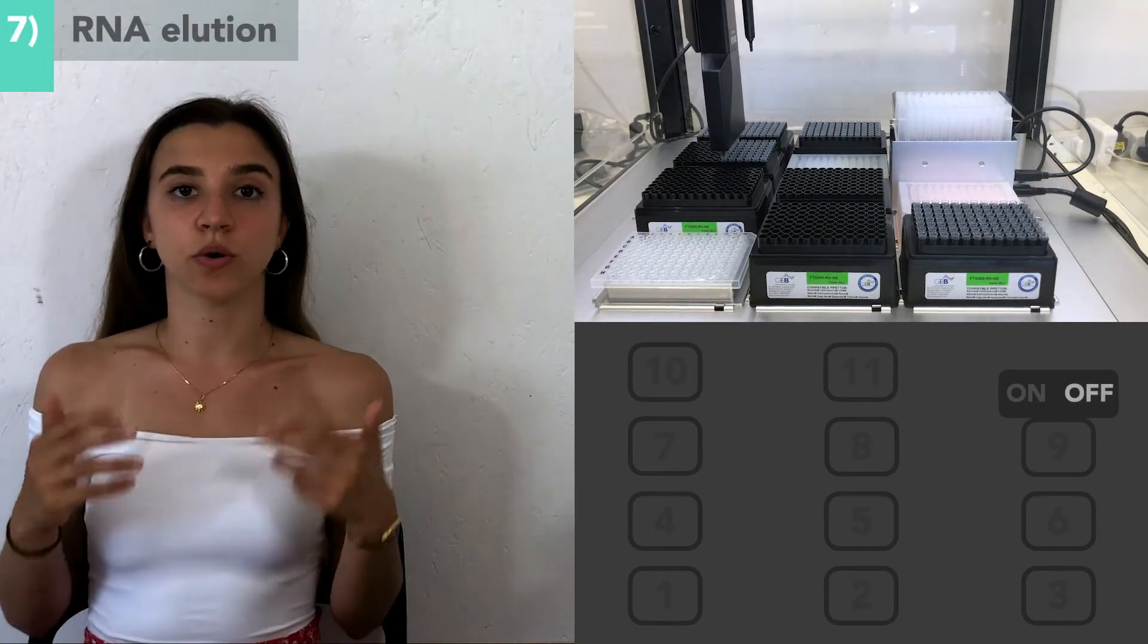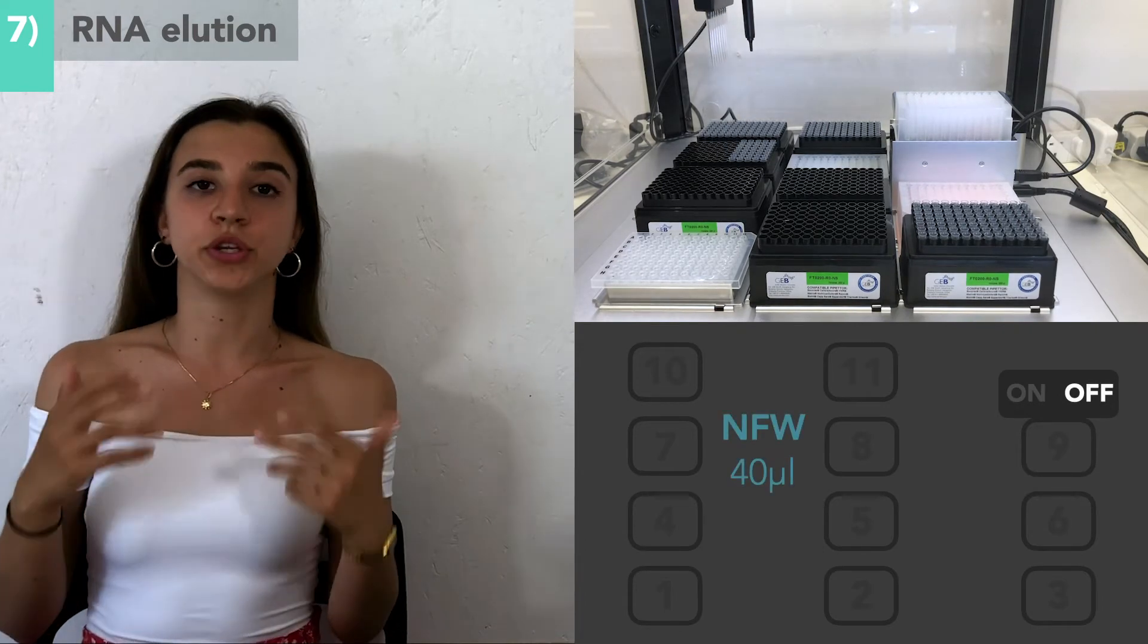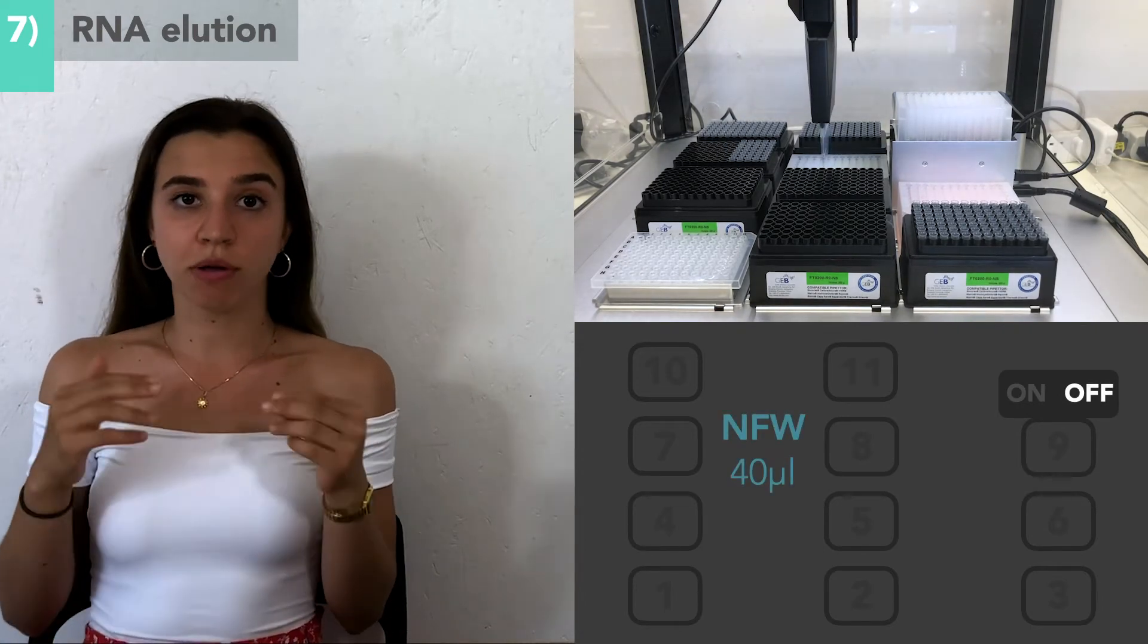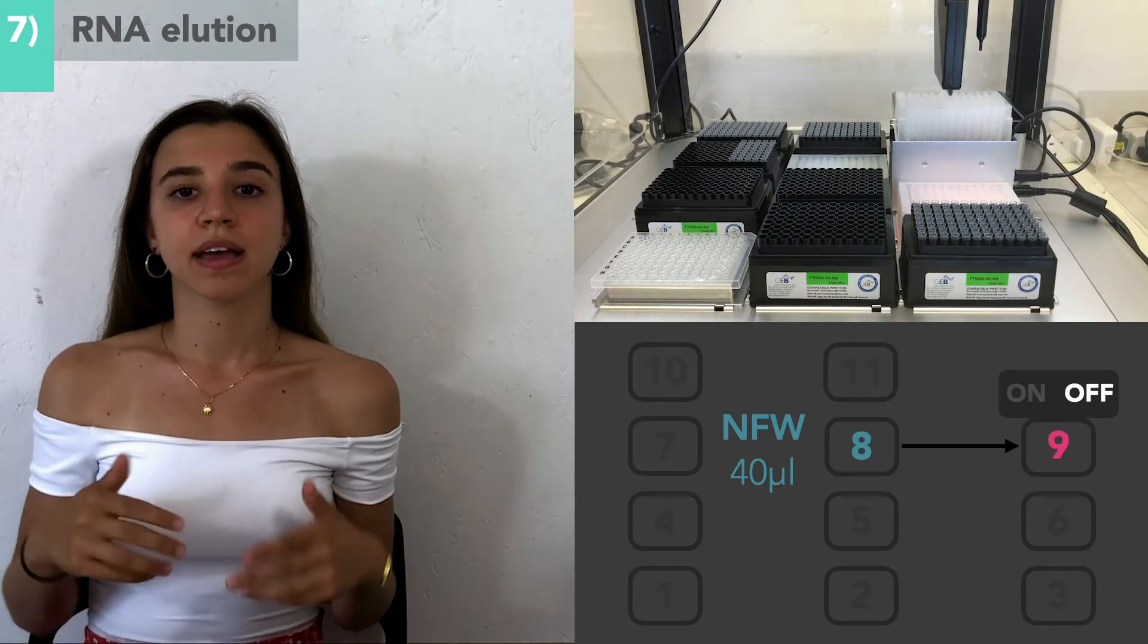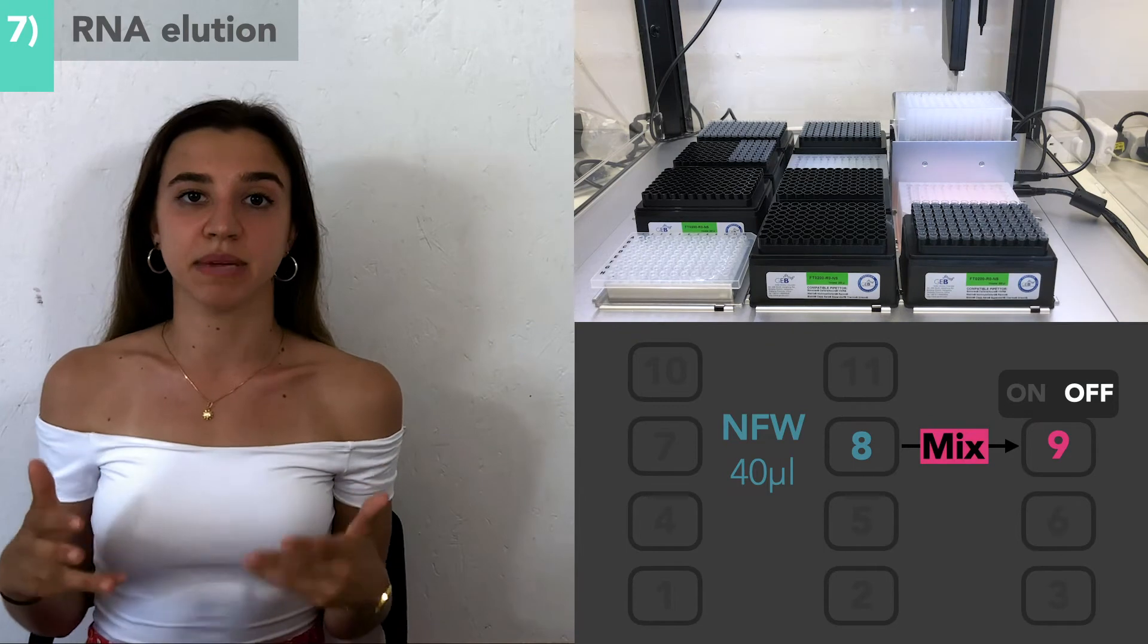While the magnet is turned off, 40 microliters of nuclease-free water from column 5 in slot 8 can be transferred to each sample well. This will then be mixed for five minutes.